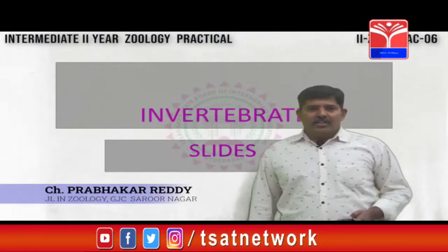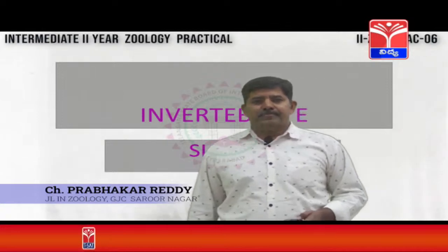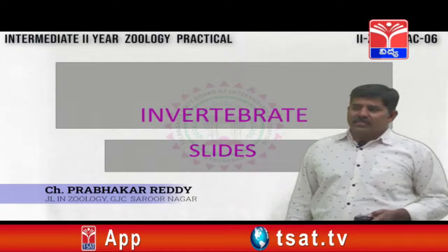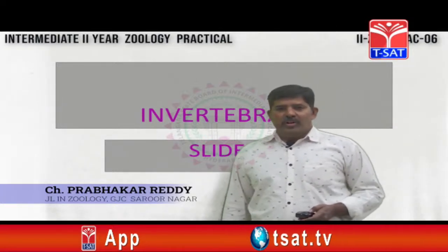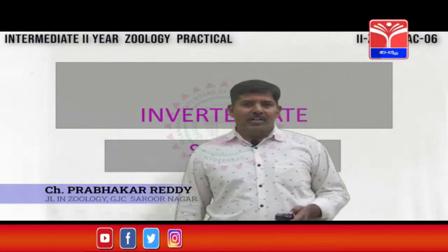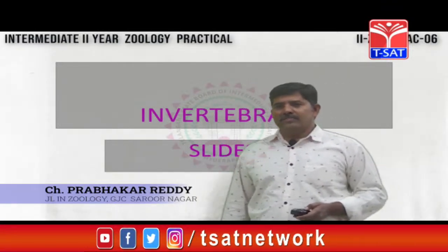Today we discuss the practicals for the second year. We already discussed section 1 and section 2. Now today we discuss section 3. In this area, we have the different types of spotters.